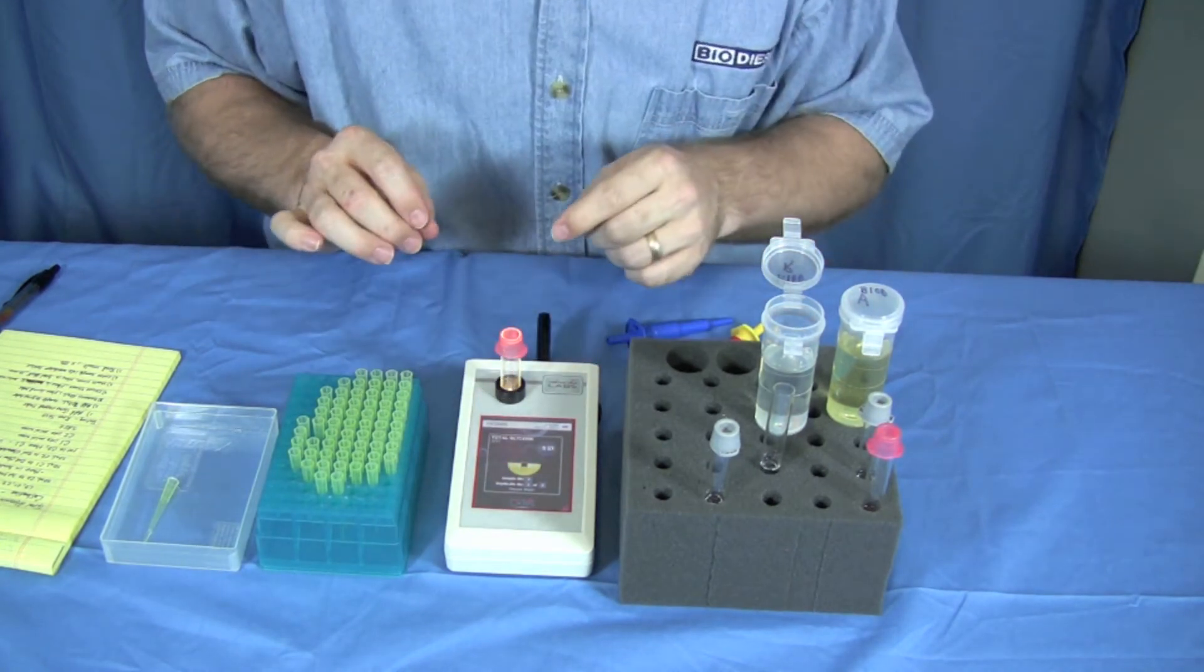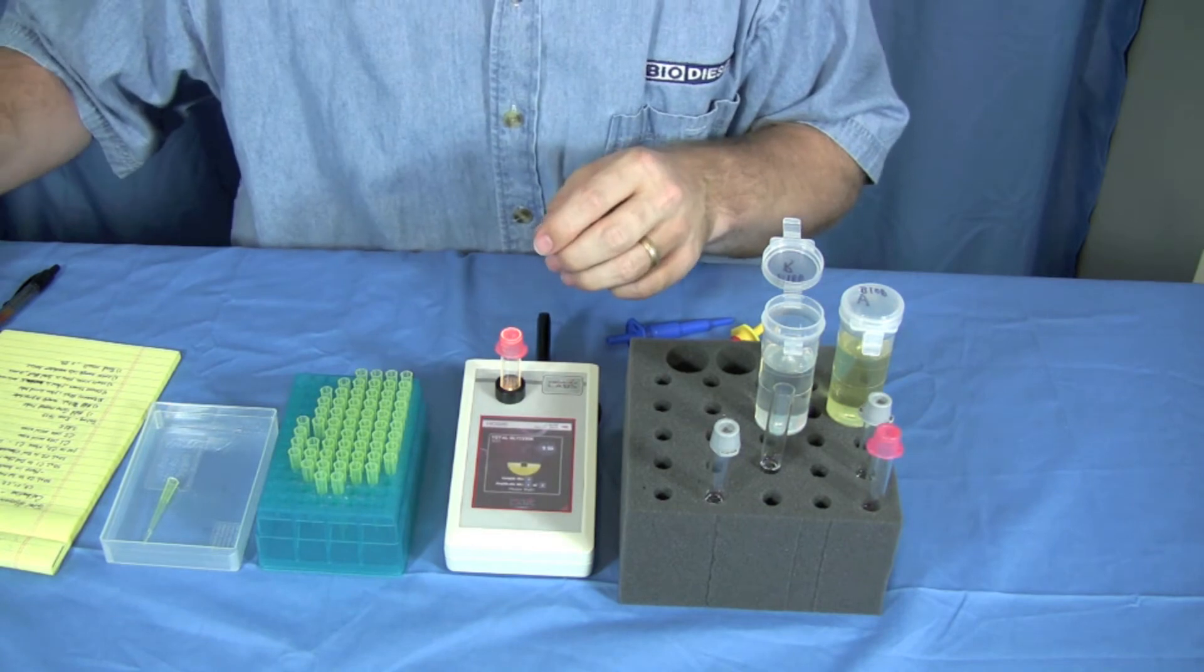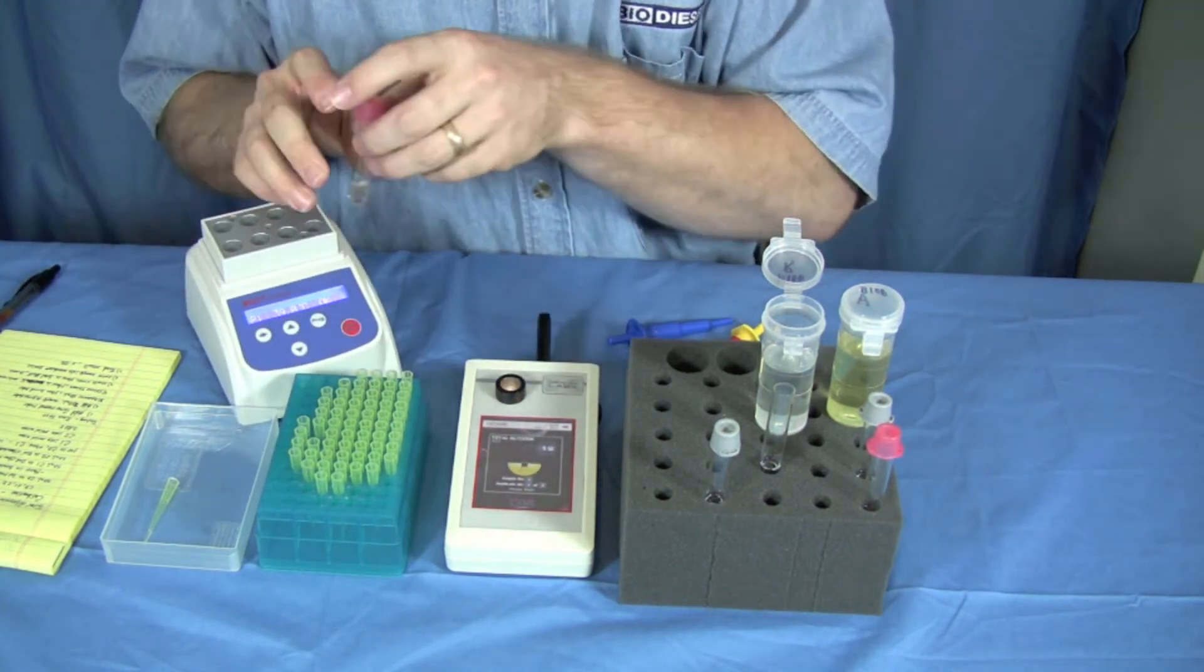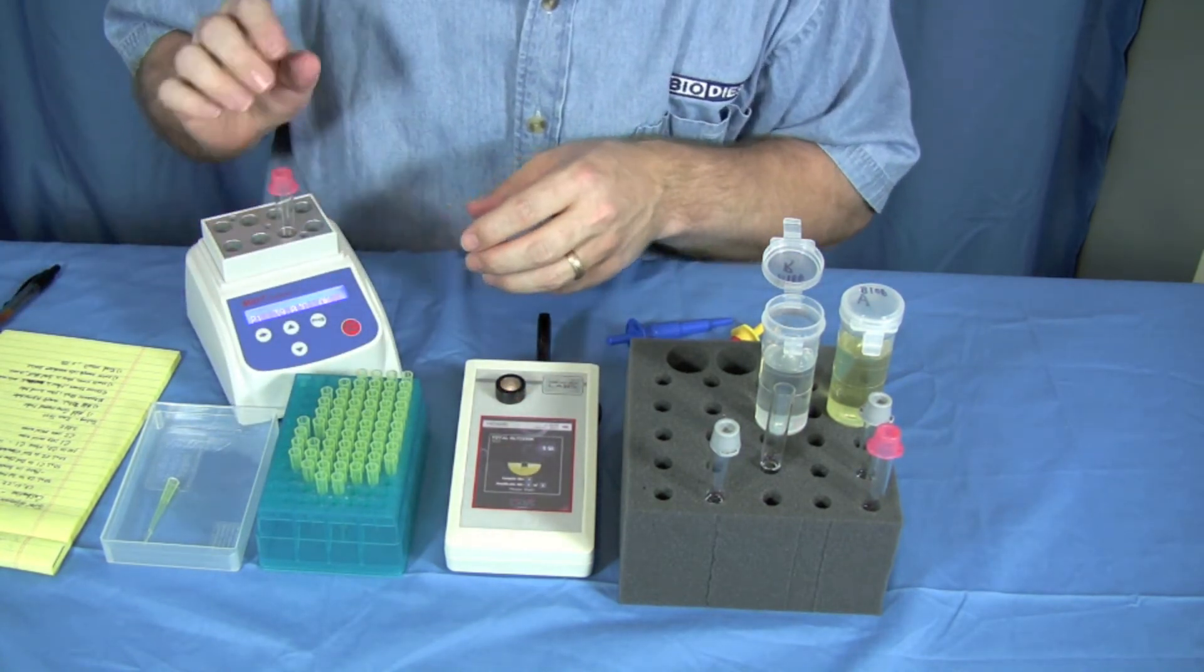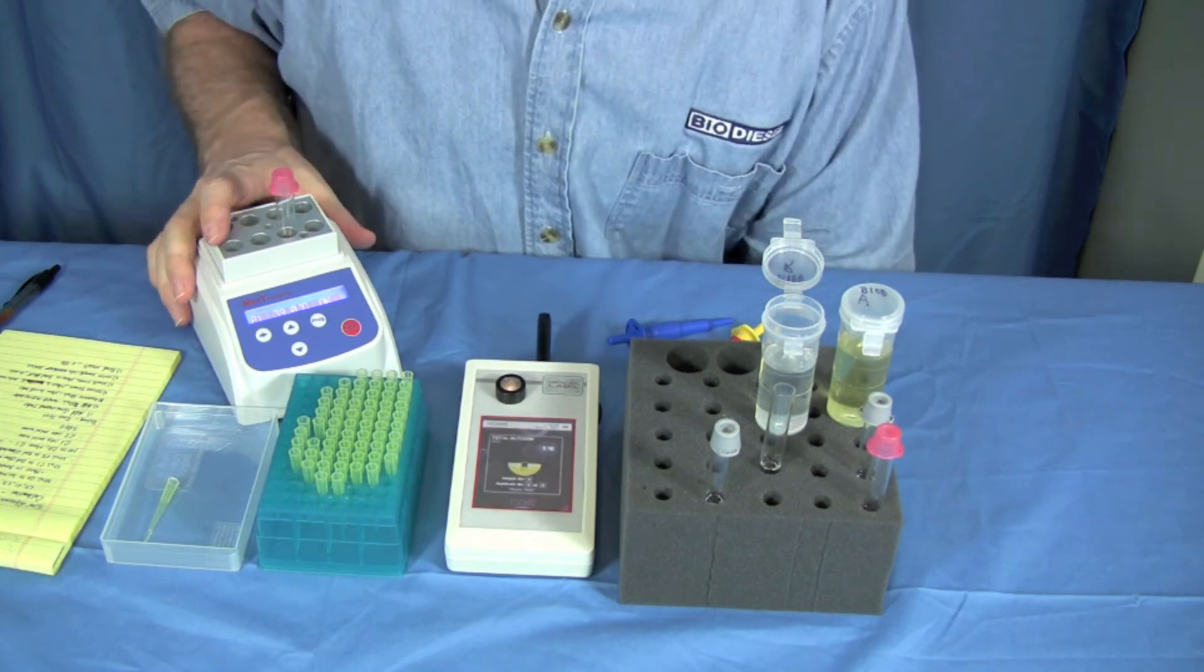And now it's asking us to wait ten minutes. So we're going to remove it. This is where our heating block comes into play. The machine is now going to count down for ten minutes.